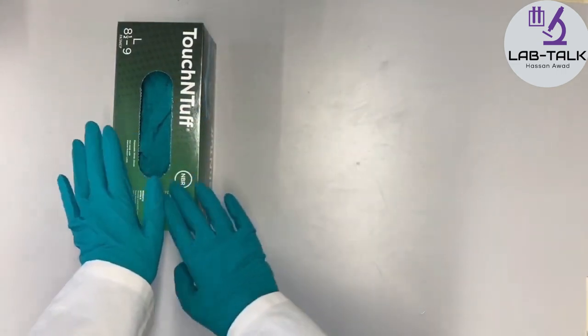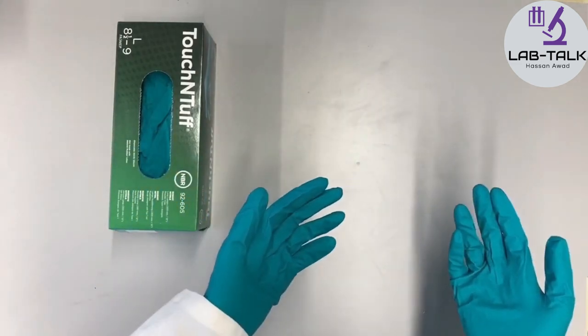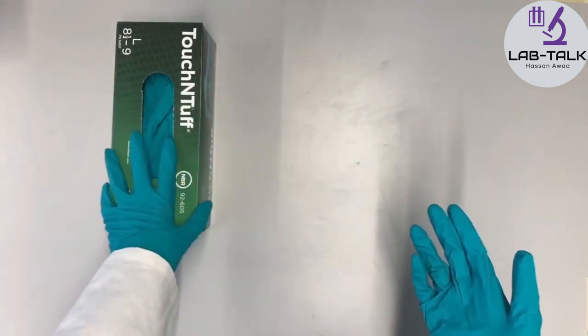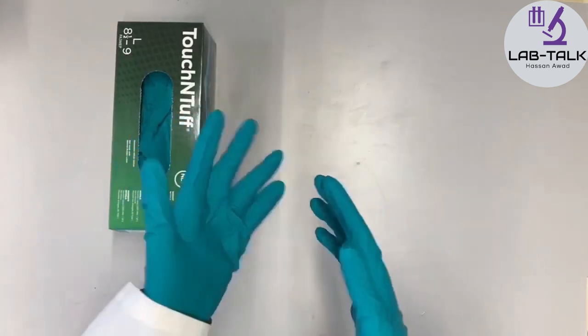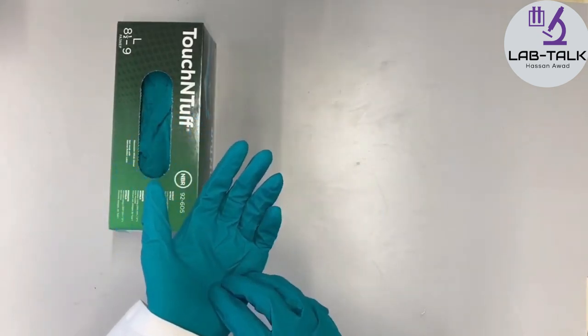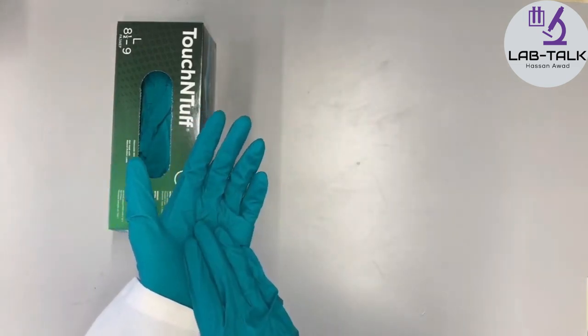For a certain amount of time. Each type of glove will protect you for a different amount of time for different chemicals. So, always check how much time it will actually protect you for. But just assume that it protects you for the amount of time it will take you to take off the gloves, before the chemical burns through the plastic.